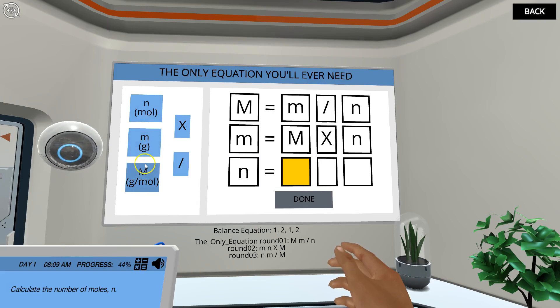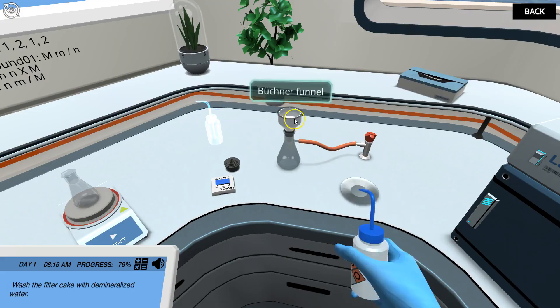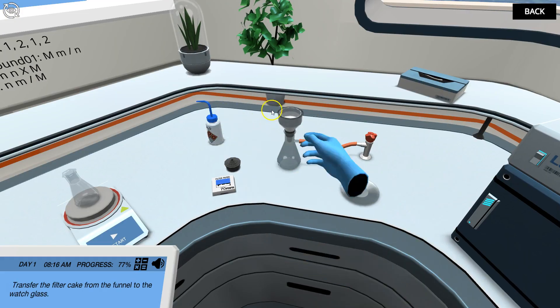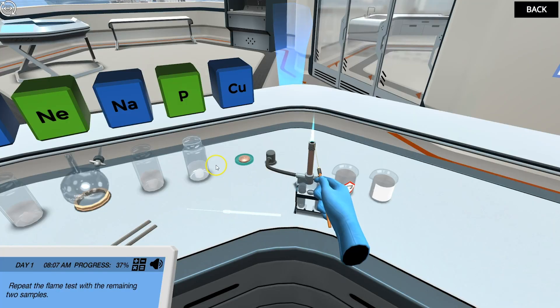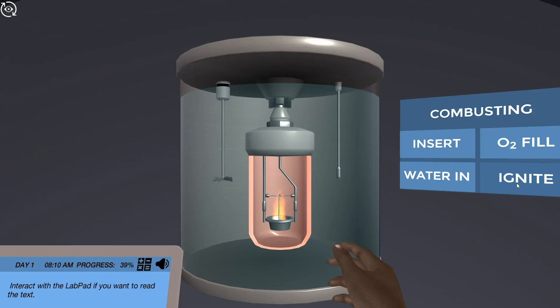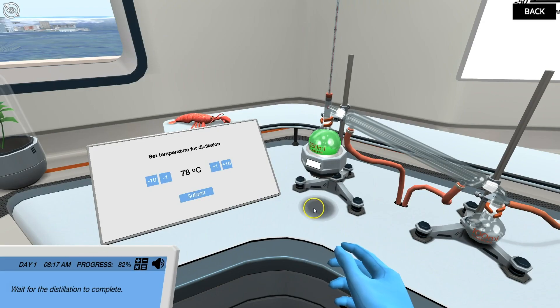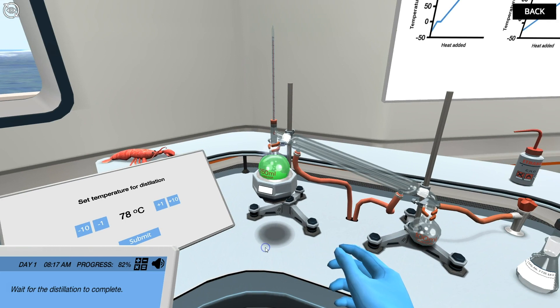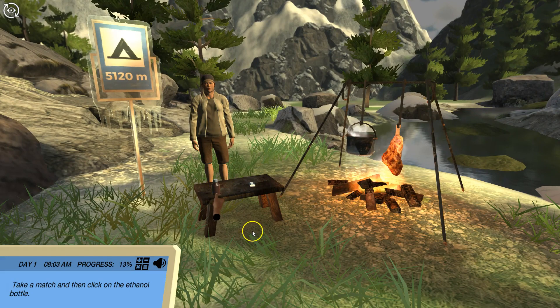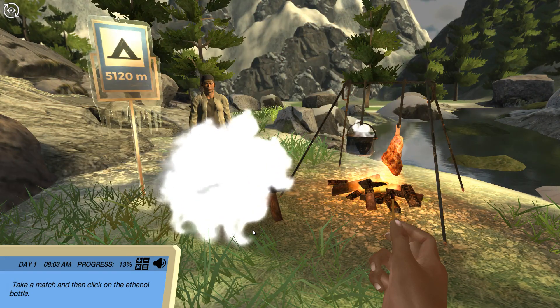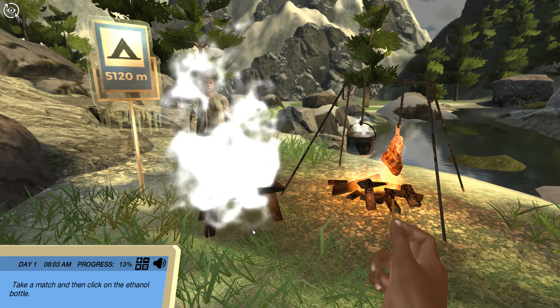Throughout the package, students will train essential lab skills such as filtration, solution preparation, pH measurement, flame test, calorimetry, acid-base titration, and distillation — in a safe virtual environment where they can make as many mistakes as they want and learn at their own pace.